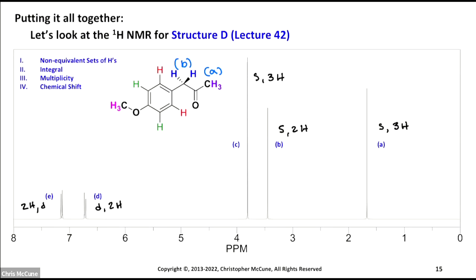Let's go down to the next singlet, C. That's going to be over here. So now you've got the ether-like, which is 3.5 to 4, somewhere in that range, but it's also next to not just the oxygen, but on the other side, you have the electron withdrawing aromatic ring. You could imagine a resonance effect making this even more delta plus. So it brings that closer to 4 most likely. But I would venture to say that this singlet is C.